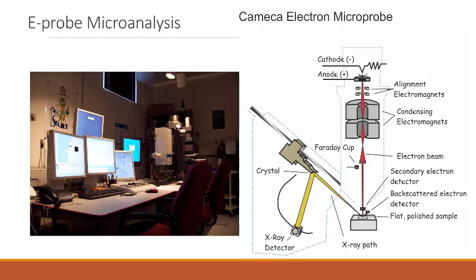If we want to analyze a smaller volume of material, say a small mineral grain or even part of a mineral grain, we're going to need a much more focused technique. Turns out that X-ray fluorescence happens in the electron microscope. Electron microscope simply puts a focused beam of electrons on the surface of a sample. In doing so, it causes the same fluorescence that we've seen by applying X-rays to the surface.